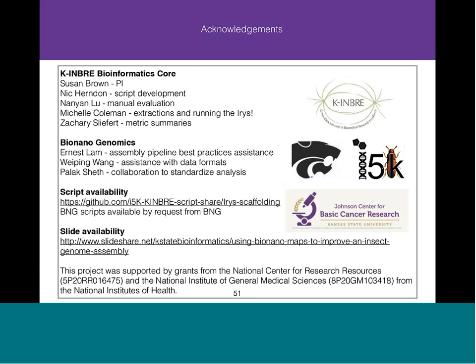This is Sue. So if you know that there happens to be the restriction site in the telomere and you have trouble assembling it because it is repetitive, as telomeres are, the BNG map can help. And I think, Todd, you can speak to that and how it helped in Arabidopsis. I think that's also on your website. Sorry, Sue, what was on our website we were discussing here? On the website, I think it's in the news brief, there's a little bit about how the BNG maps help assemble into the telomeres in Arabidopsis.